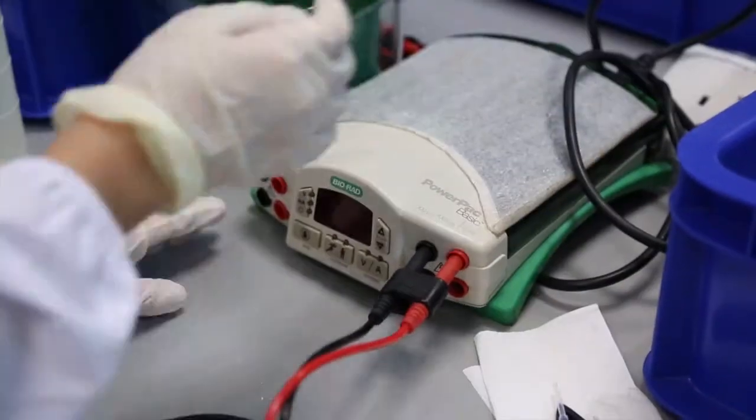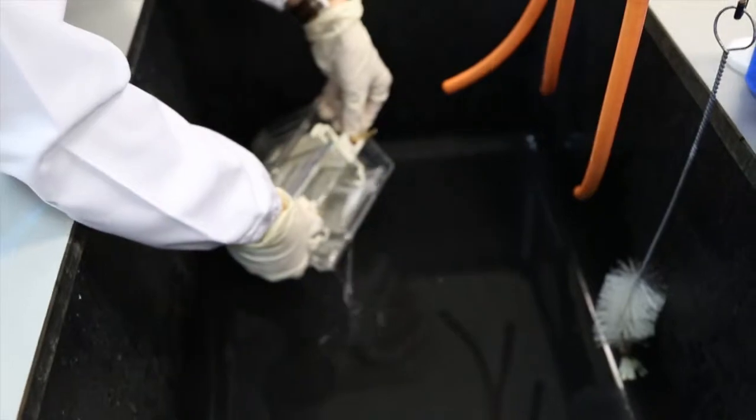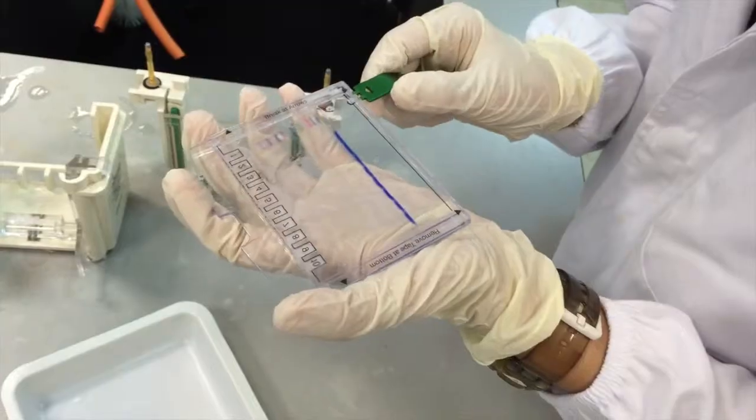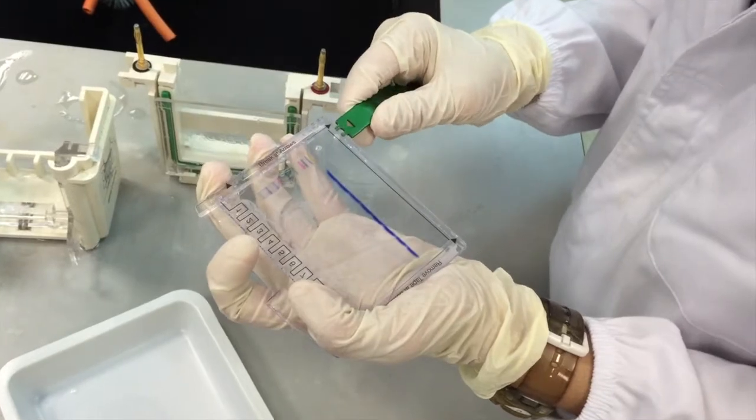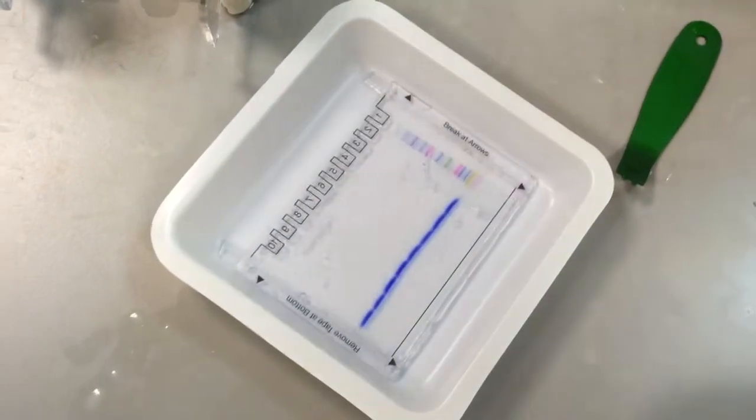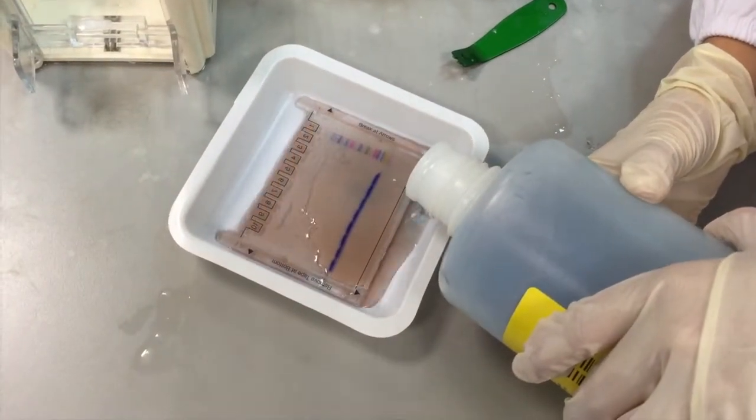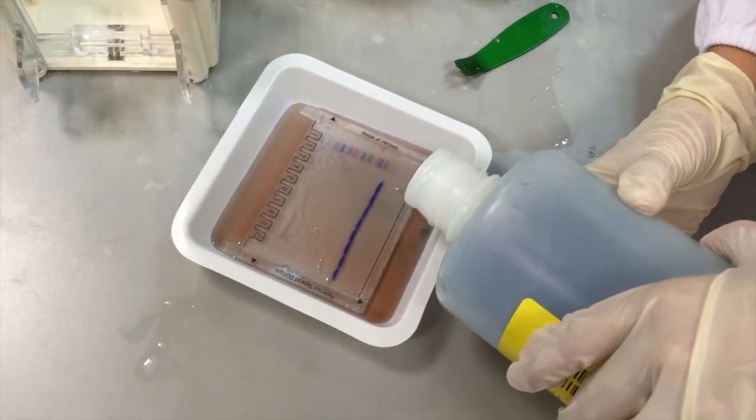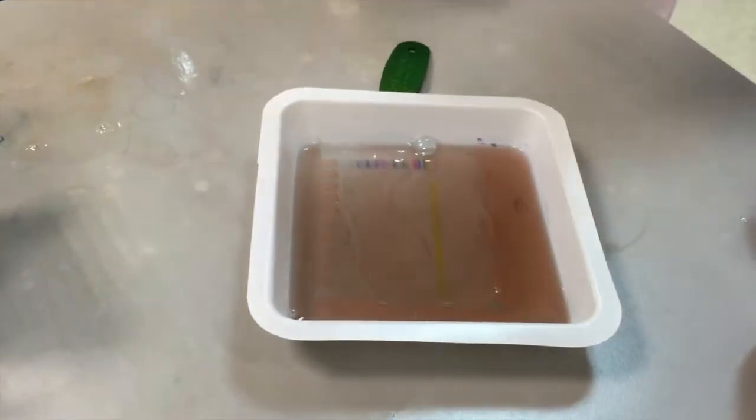After the analysis, turn off the power supply and disconnect the electrical leads. Discard the buffers and remove the gels from the gel cassette sandwich by separating them gently. Transfer the gel onto a staining plate and pour Bio-Safe Coomassie stain into the plate. Stain overnight to see the colored bands of the sample.